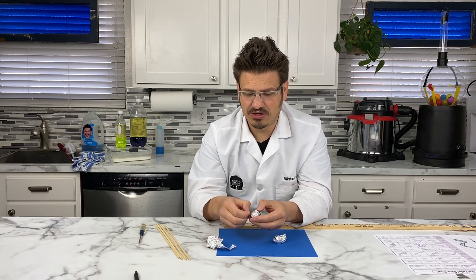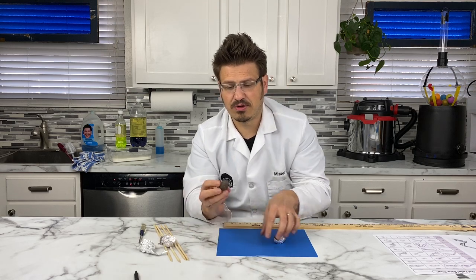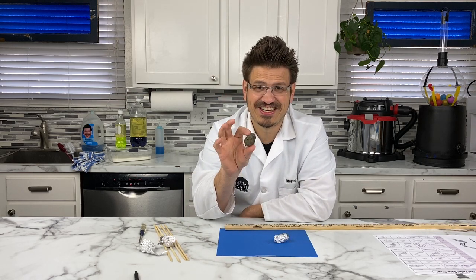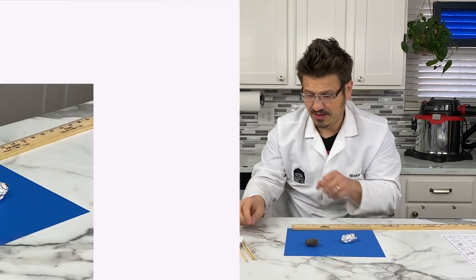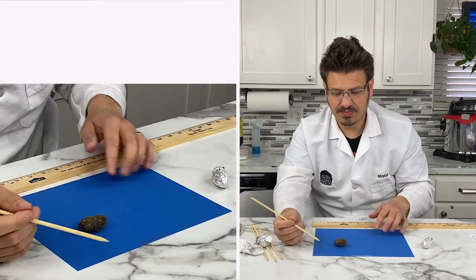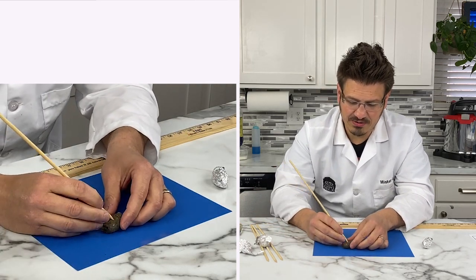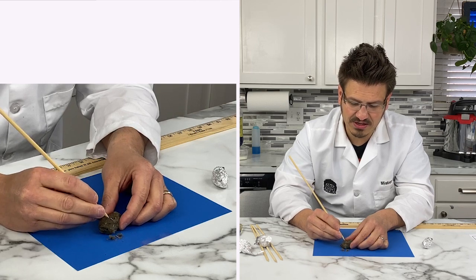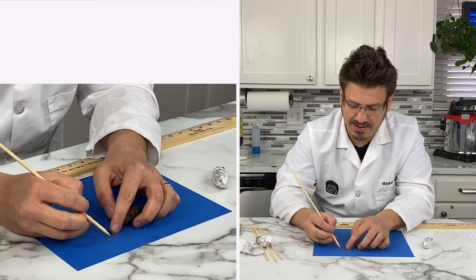And I know it's gonna be dark and people are gonna think, ooh, it looks gross. It kinda is, but that's all the fur from this. And these have been disinfected. All right, so we can handle them. And what I have is just a skewer stick. And what we're gonna do is we're going to actually start to break this apart. And you can see instantly, there are all these little bones that pop out.